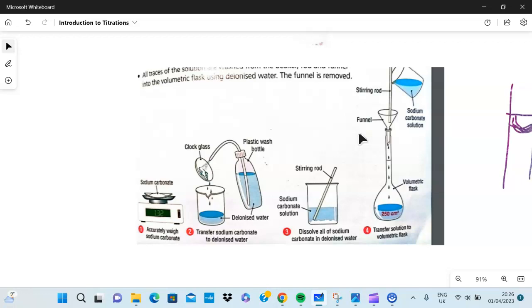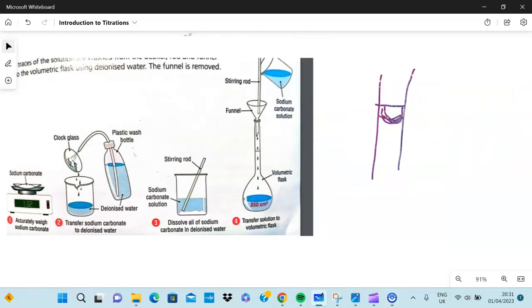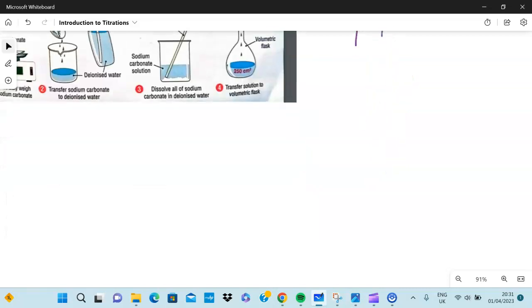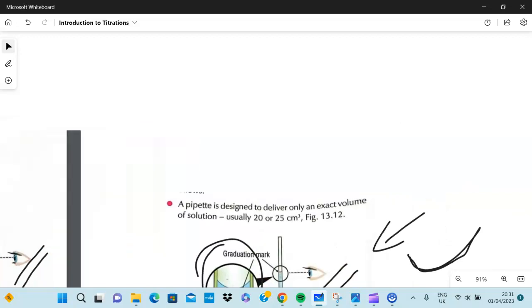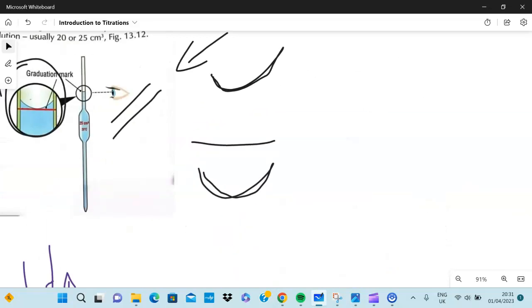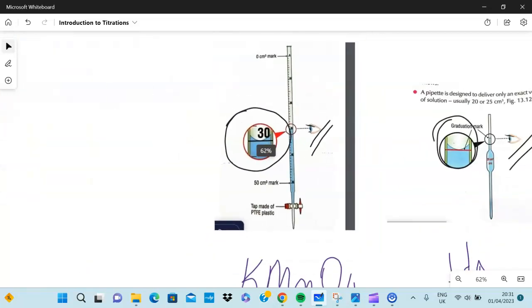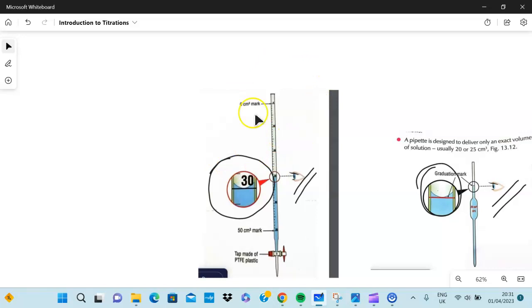You take a dropper and then put water, deionized water, dropwise till the bottom of the meniscus reaches the graduation mark. The meniscus, for those of you who don't know, is this curvature kind of line that the water forms. It does not form a straight line, it forms a curve.